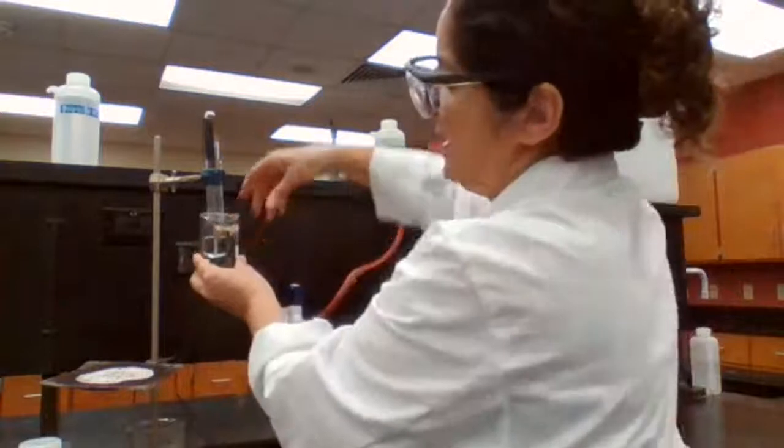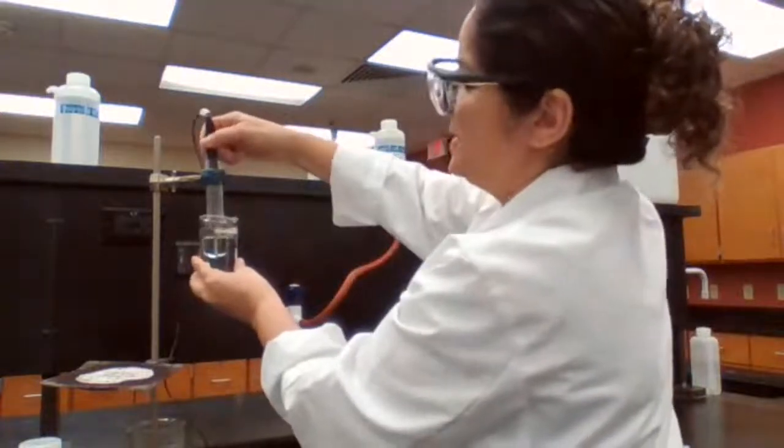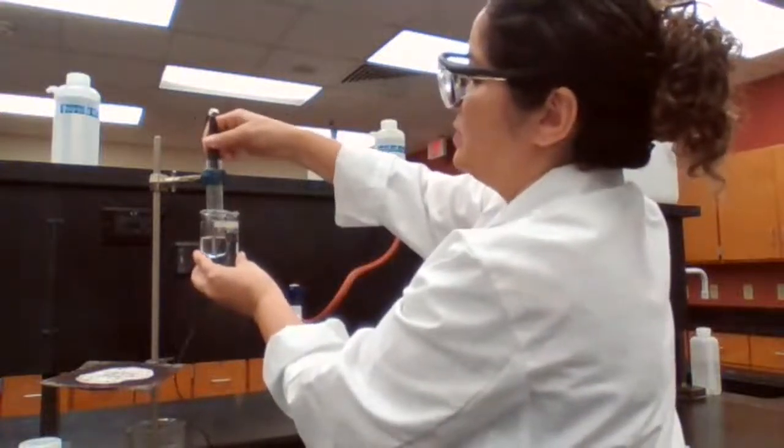We can place it in room temperature water, or we can just give time for the temperature to drop.